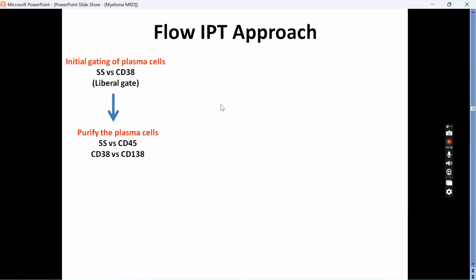cells. They exhibit CD38 in such a fashion that they just lie below the plasma cells. Okay, and as you rightly said, normal myeloid blasts are sometimes missed. So the plasma cell gate includes some amount of basophils, hematogones, monocytes, and normal myeloid blasts. Also immature NK cells. Perfect, very good. Excellent. So even NK cells.